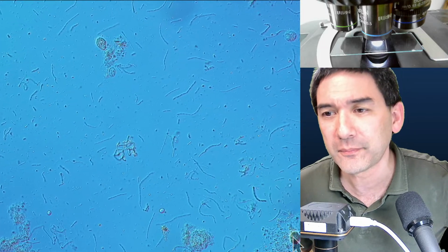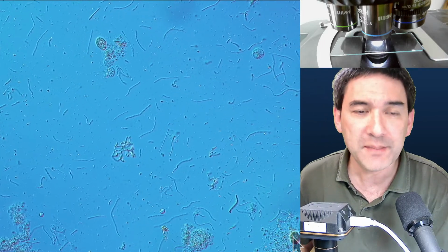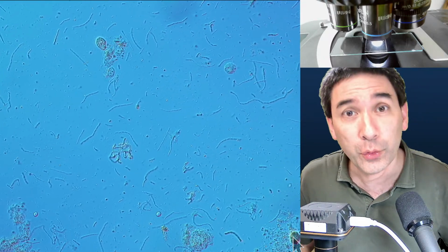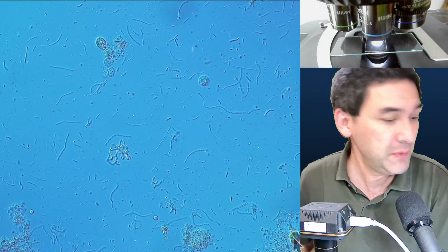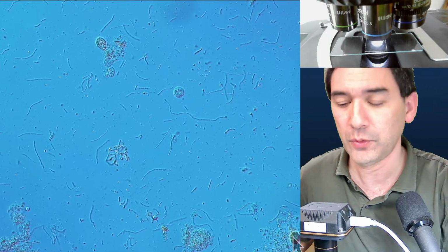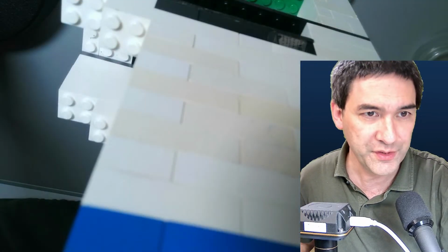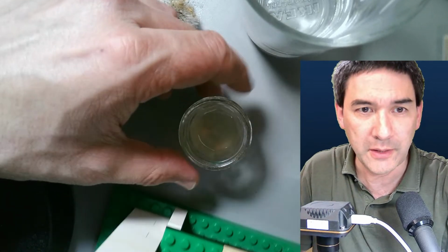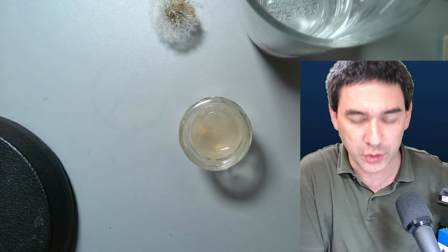Is it safe to keep that in your room? Let's put it this way: every time you're dealing with unknown bacteria, you have to have a healthy respect. So if you look at this jar over here, I'm going to switch over now. Let's put the microscope away. What I've done is, this is called an enrichment culture.